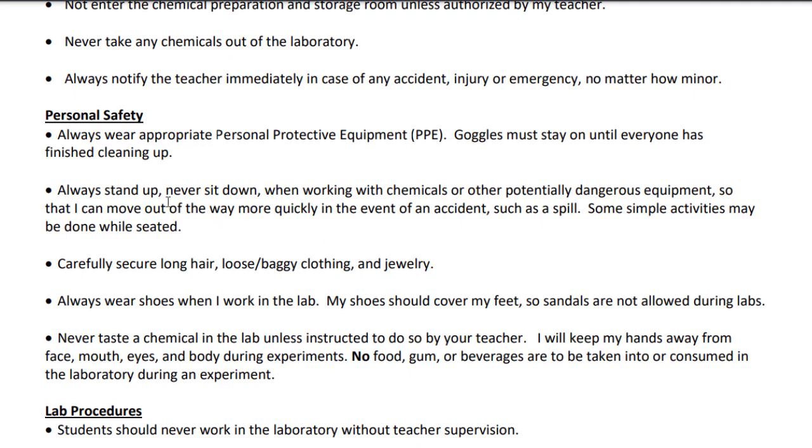When you're doing a lab, and I'll show you again when you get in the building, you're always standing up. Never sit down near a lab bench because if something falls and you're standing, you can jump away very quickly. But if it falls and you're sitting down, it's more likely to land on your lap and you're not going to be able to get away as fast. Plus, you give it a bigger surface area to land on. So maybe if you're standing up, you might have gotten splashed a little, but if you're sitting down, maybe the whole container lands in your lap. So we're never sitting down if we're using chemicals at the lab bench.